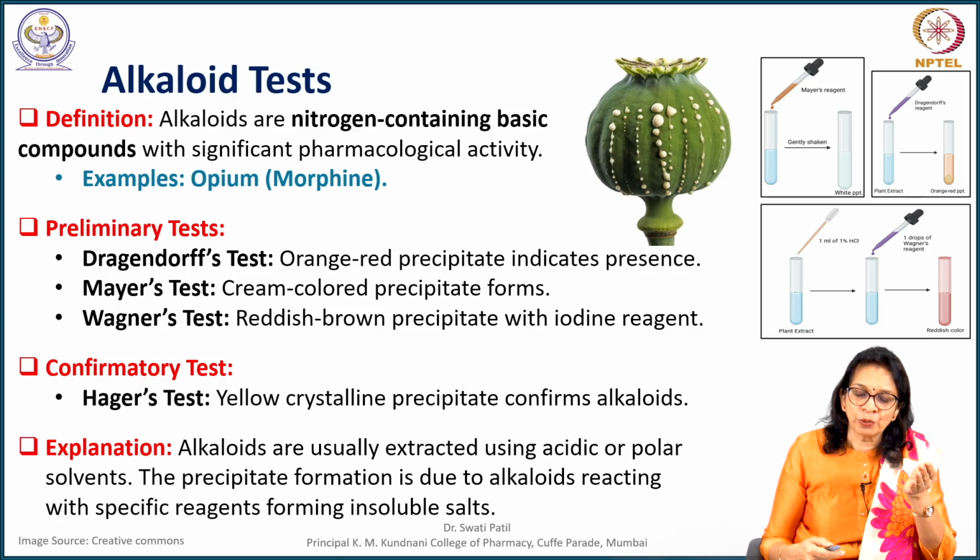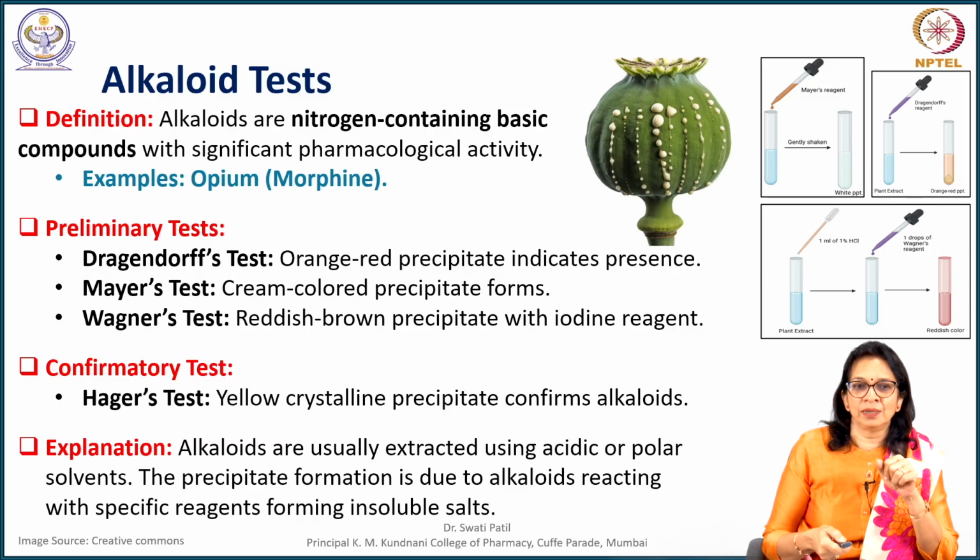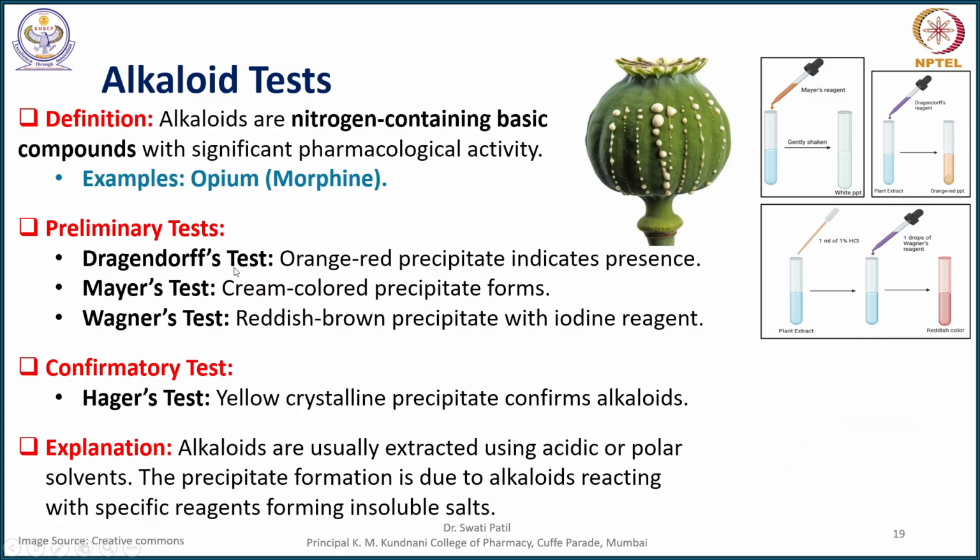Caffeine alkaloids or purine alkaloids answer the murexide test. So, depending on each class, we have different tests. The alkaloids from cinchona bark answer a confirmatory test called the thalleioquin test, but here we will just restrict ourselves to the preliminary tests which are used to detect these alkaloids.